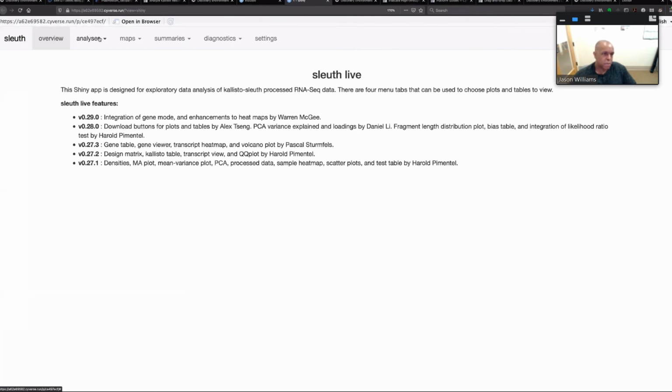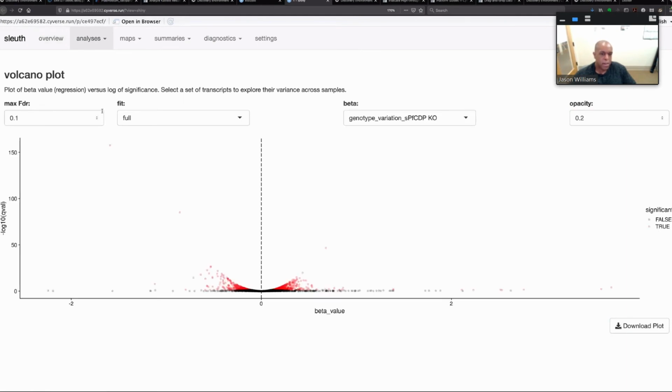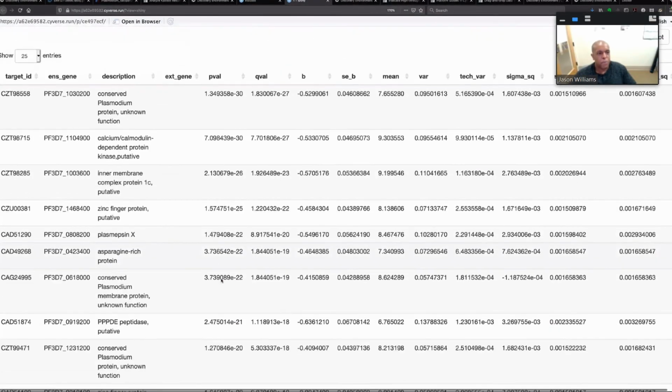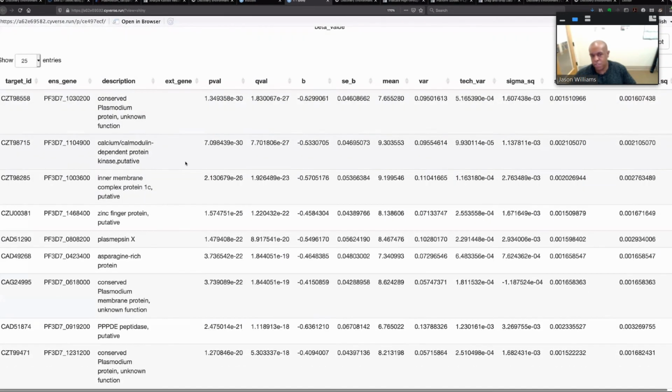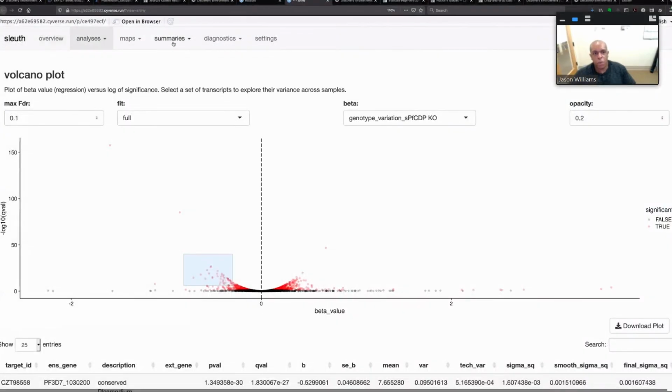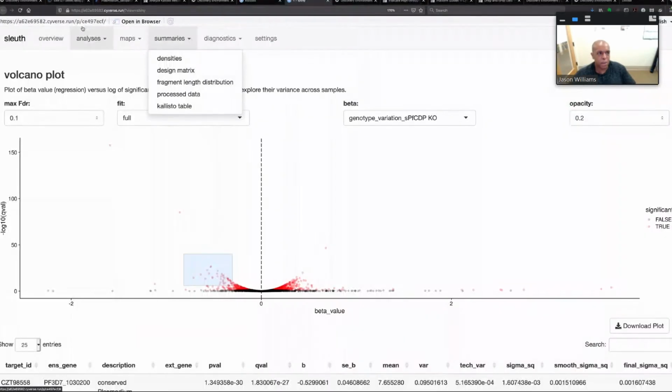And now, for example, when I go back, and there are other things up here, but if I go and reload that volcano plot, we're getting better results because we're able to separate out these are the ones that are downregulated. And we see some of these calcium kinases showing up even in the first sort of list of genes, right? So you could go through and there's more sorts of things in here that I won't have time to show you, but it shows you the power of data visualization, and to really explore those data that you have in order to look into this experimental result.